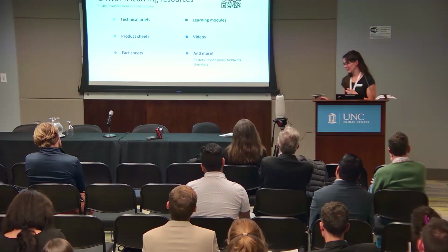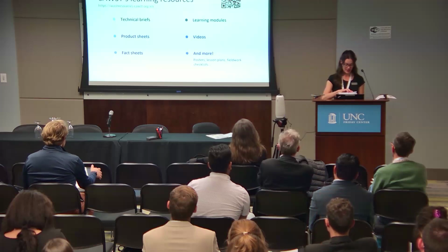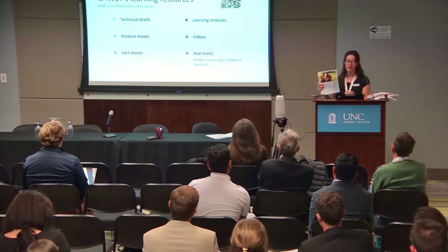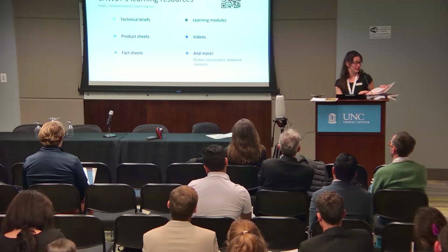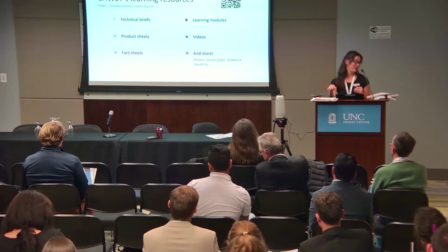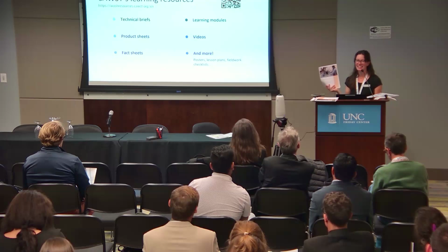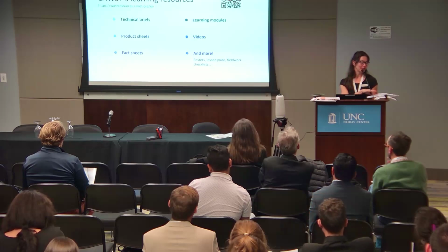So we have things like technical briefs, so things like general aspects of drinking water quality, just an introduction to the background of water quality. We have a specific guideline into how to test for microbiological aspects of drinking water. Same thing for chemical aspects of drinking water. And for acceptability, so things like turbidity and salinity, we categorized it under acceptability.